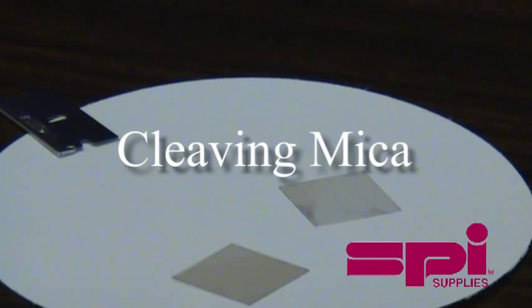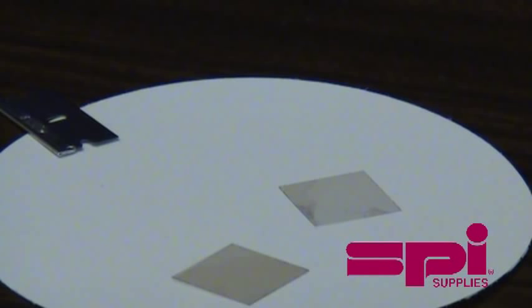Welcome to SPI Supply's video resources. This video will demonstrate how to effectively cleave mica substrates.